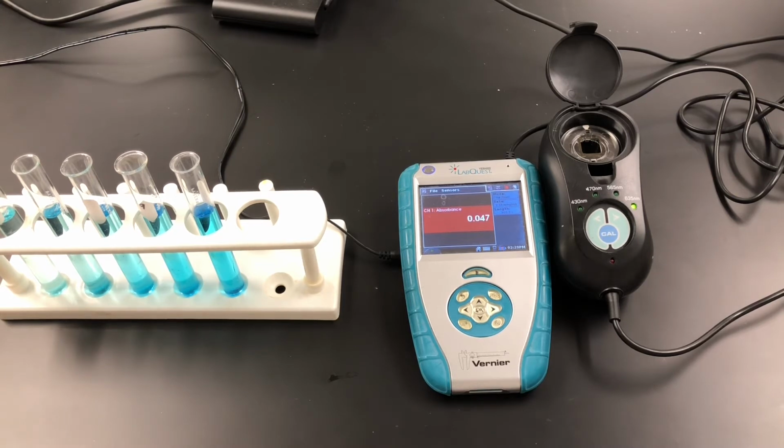Now what we're going to do is just fill the cuvette with each one of our solutions and find their absorbances. So here's our first one. This is test tube number 1.